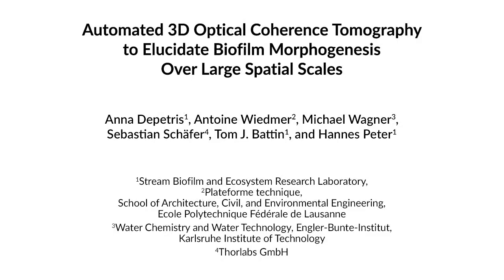Here we present an automated system based on optical coherence tomography, or OCT. This allows us to monitor biofilm structure over large spatial scales or extended periods of time. OCT imaging is well suited to resolve structures in the micrometer range. However, it's currently limited to a maximum area of about 250 square millimeters.